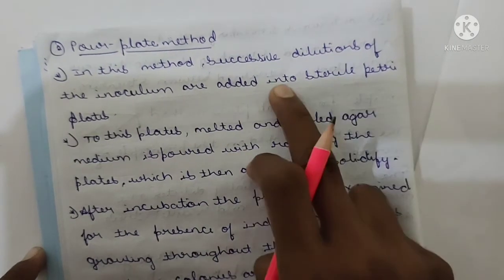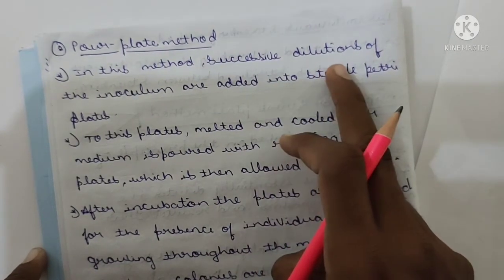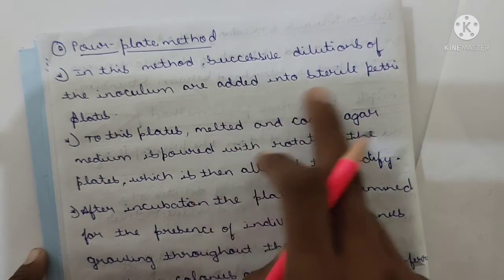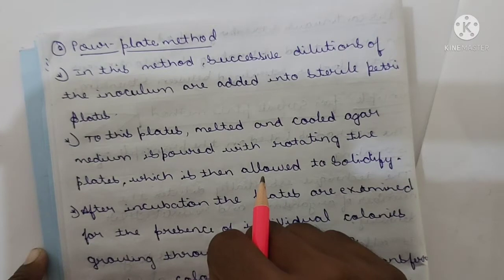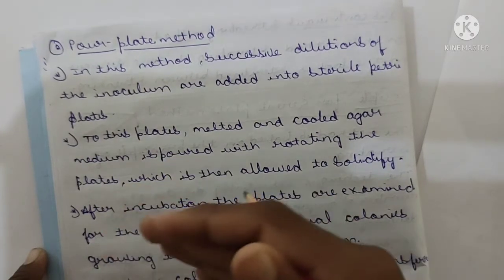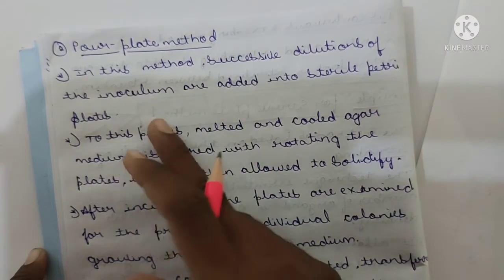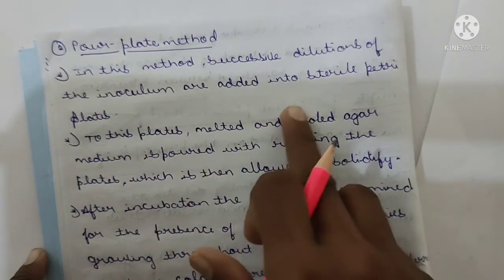In this method successive dilutions of the inoculum are added into a sterile petri dish. Here, successive dilutions of inoculum are added where? Into the sterile petri dish.